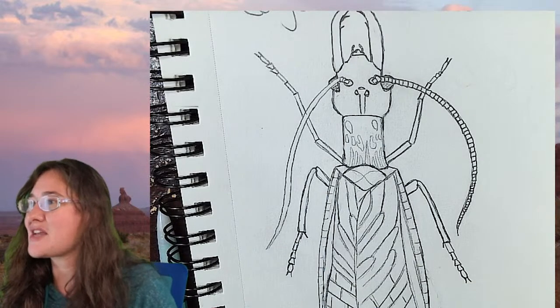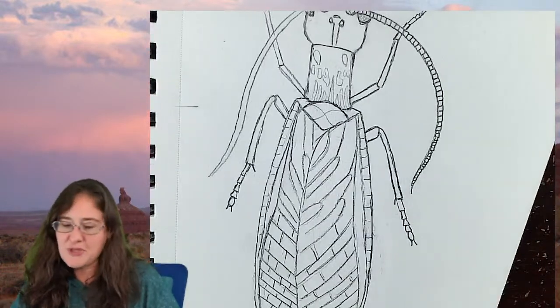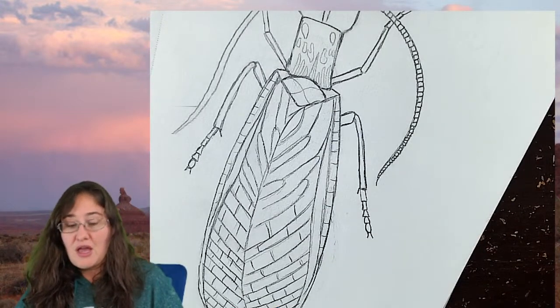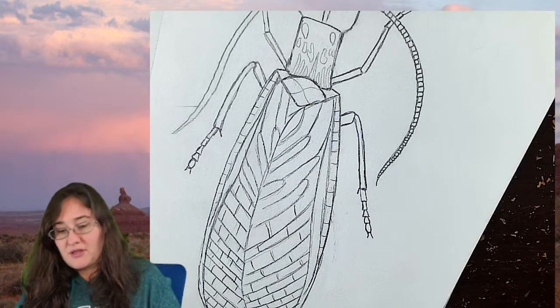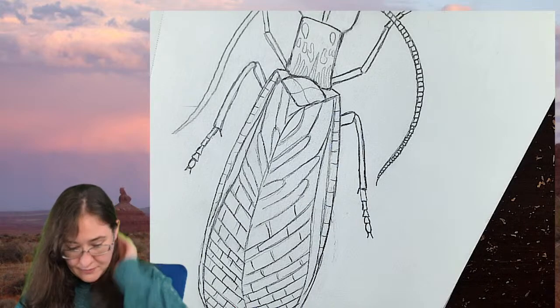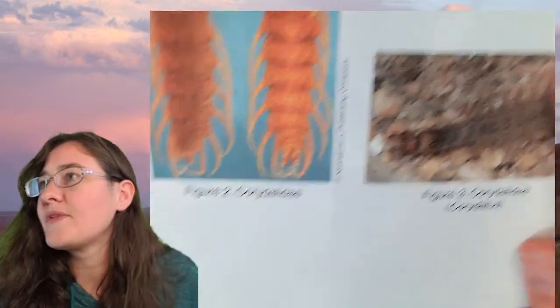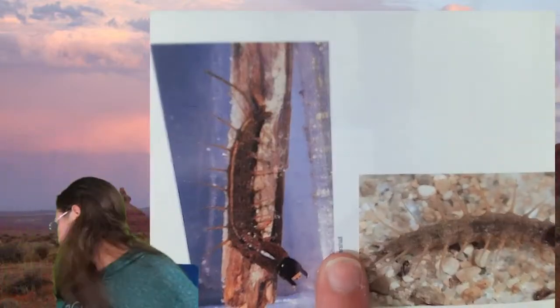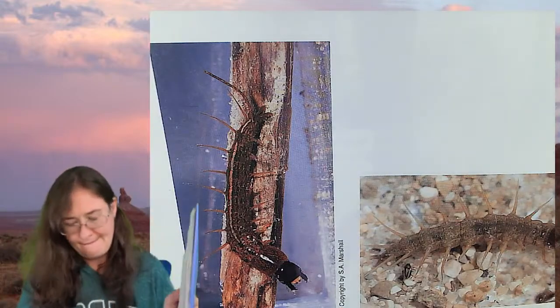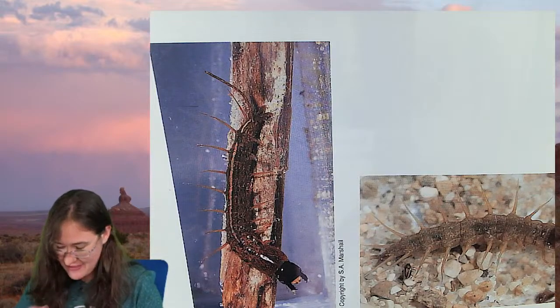What are the spikes coming off? I imagine them to be gills, but they don't look gilly. They are not gills. Let me show you those one more time. Alright, so we've got these. I'm double checking with my notes really quick.